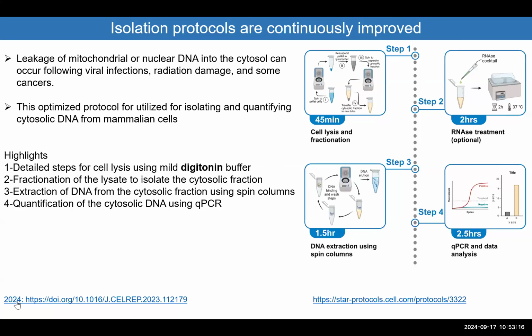And these protocols, from time to time, become more and more complicated and more updated. So this is a paper from this year, which is showing you that in case you are isolating DNA from the cytosol, you might have contamination from some DNA that comes from the mitochondria or from the nucleus.